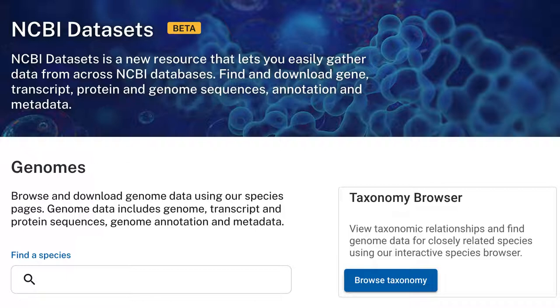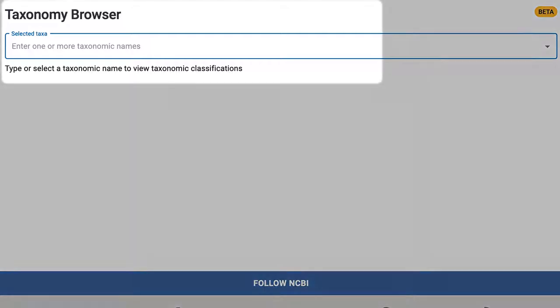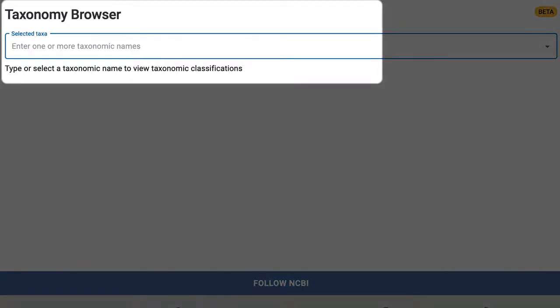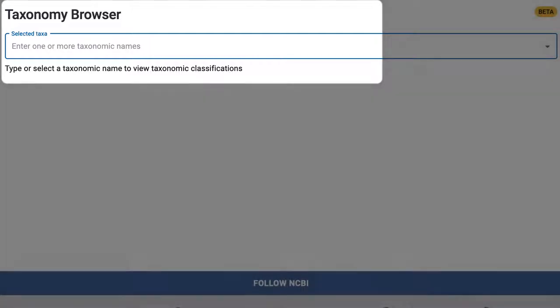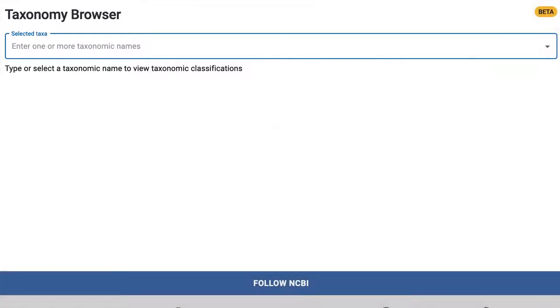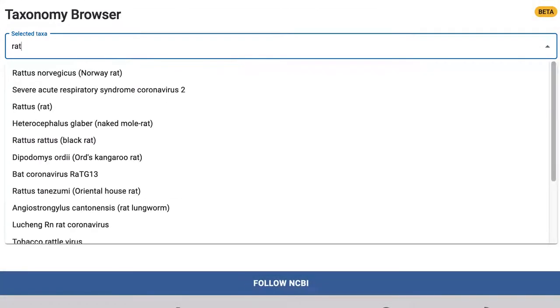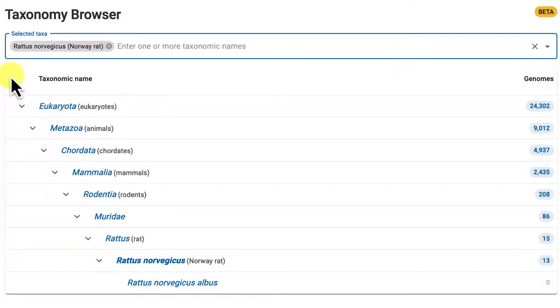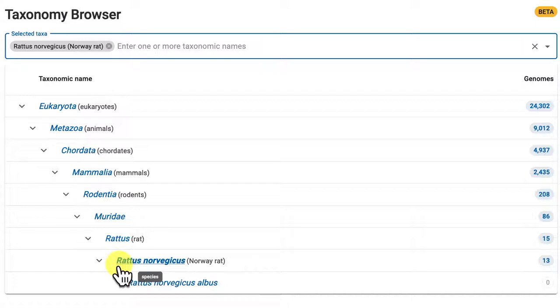Starting on the Datasets homepage, click the Browse Taxonomy button. The taxonomy browser allows you to search by any taxon name or rank, common or scientific. I'll search with RAT and choose Norway RAT. You can easily view the taxonomic context or lineage of your taxon and click on the species name to find data for that organism.